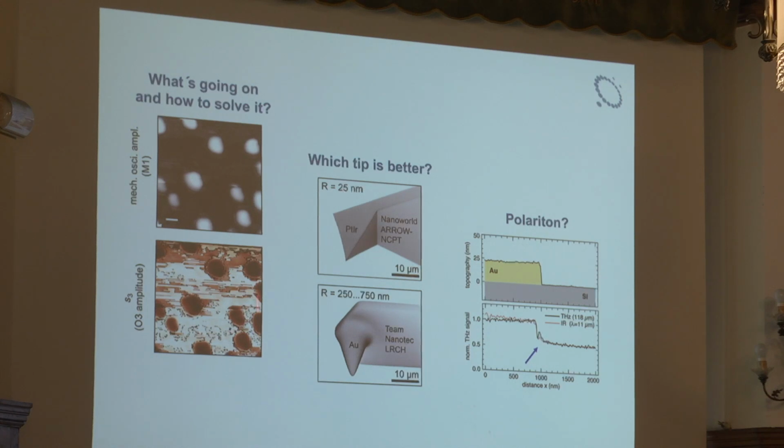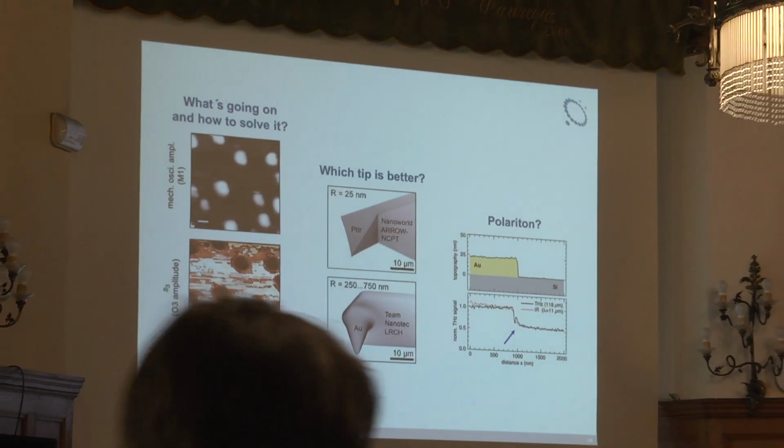And the other thing is, and that I saw lately quite often in the lab, and the solution is quite simple. But if you don't know it, it's maybe tricky. So here we have a topography image. This is, I think, Eugene actually did the experiment. What was that? That was some dirt particles on top of silicon. That's the topography image, and that's the optical amplitude image. And it happens quite often that you see this kind of jumps here in the amplitude signal. They also appear in the phase signal. What's that? Where is it coming from, and how can you get rid of this? So 3 questions.